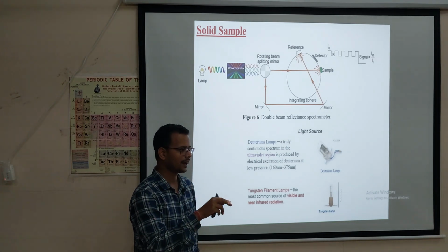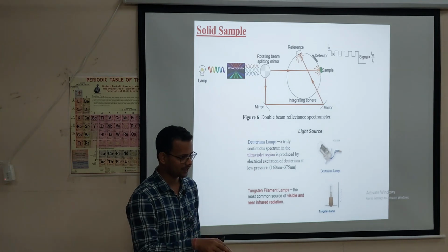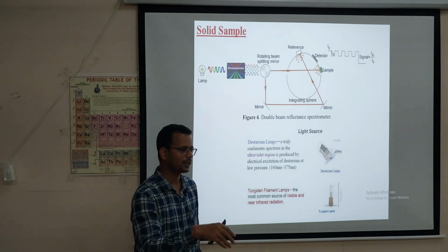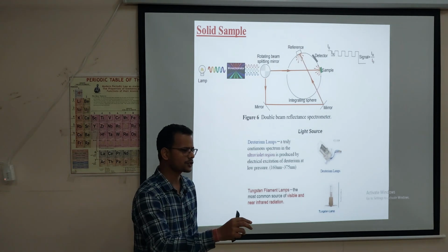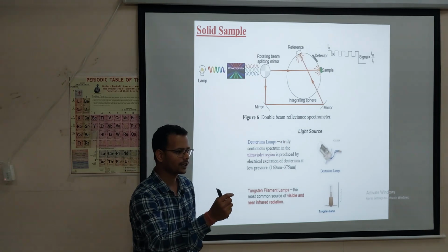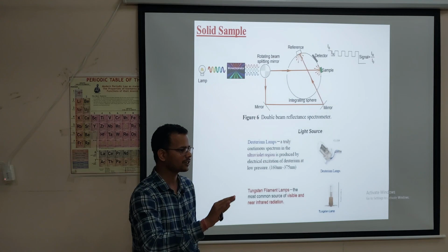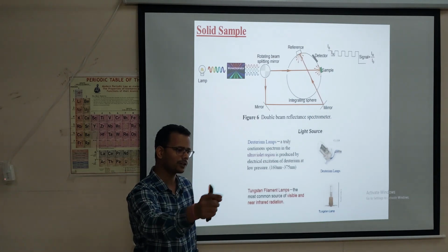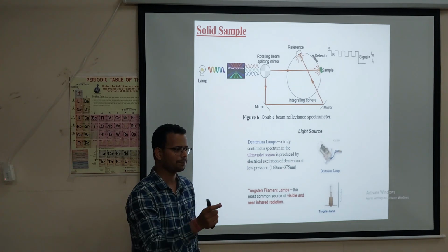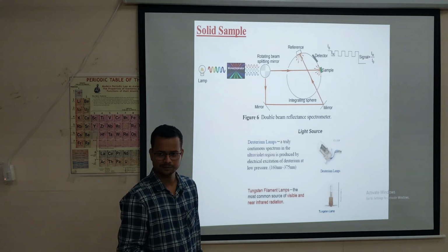And as every person is not the same, similarly every sample is not the same. We will get different band gaps for different samples. In some cases, we may get, suppose, 2.7 eV for 5 or 6 materials having the same band gap, but that does not mean all the properties of those samples are the same. Band gap matching does not mean the properties will match. Okay.